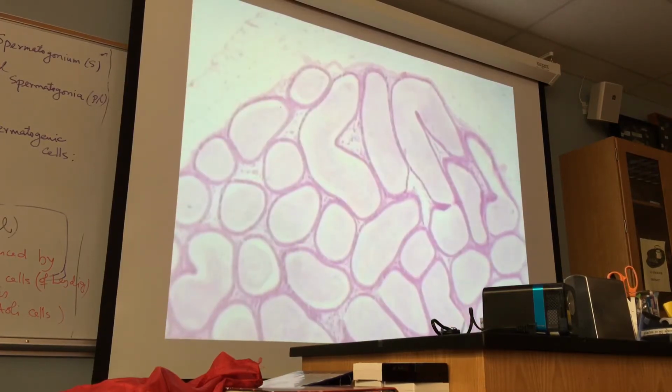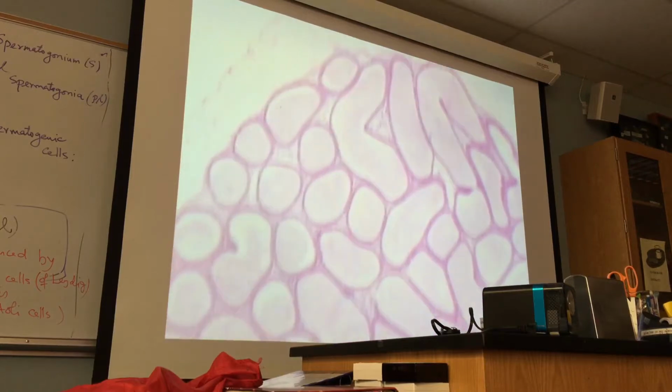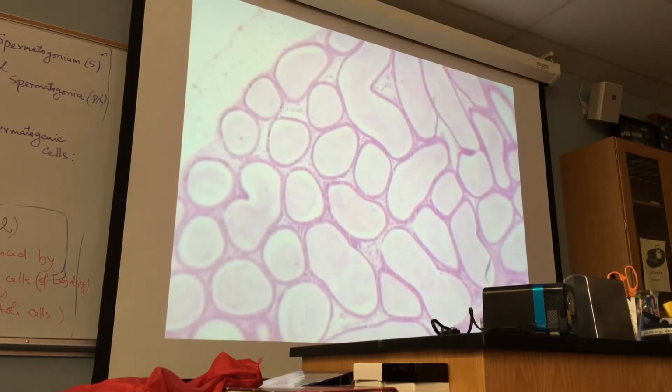And this is the head of epididymis. If you uncoil the epididymis, it will be like 20 feet long. Yeah? I mean, in human male. So a 20 feet long duct is squished in a very small space.